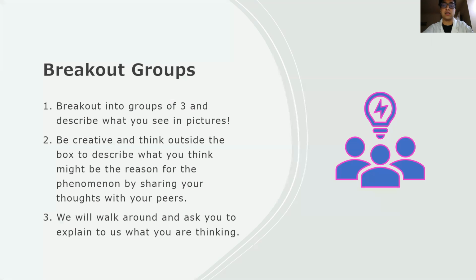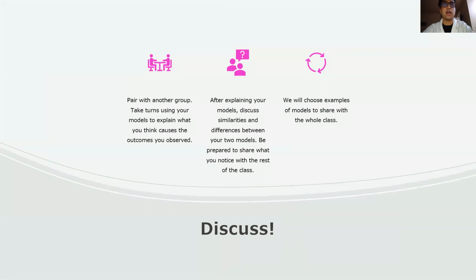The hypothesis doesn't even have to be a proper hypothesis. It could just be a normal question, or a blurb of what you think is happening. And then after that, we can also discuss it after pairing with more groups. Once you pair with other groups, discuss your ideas with them as well. Collaboration is key for experiments like this.